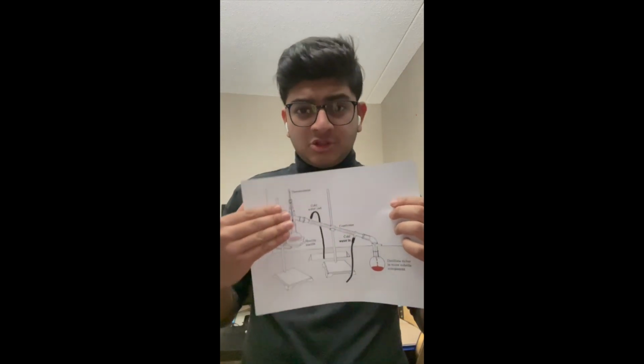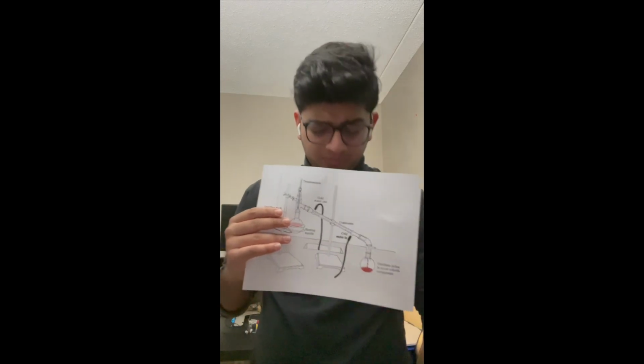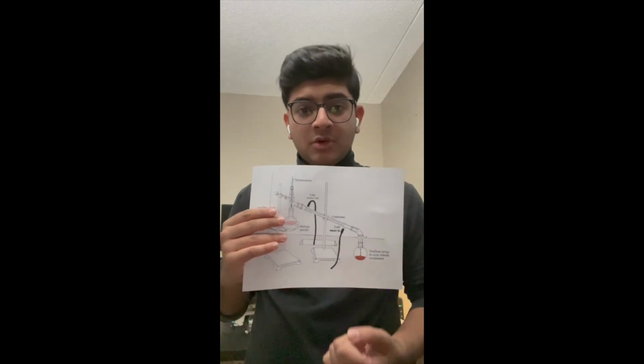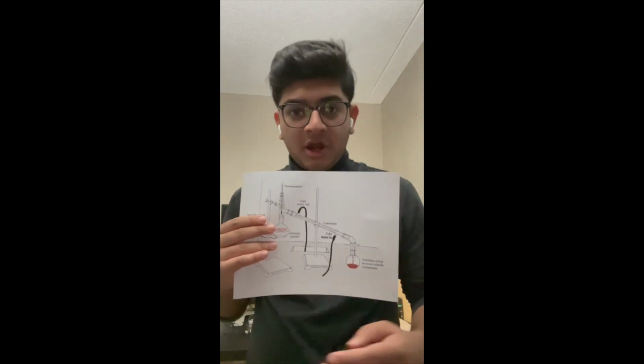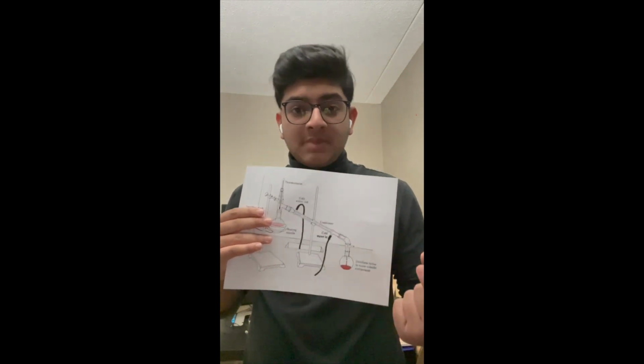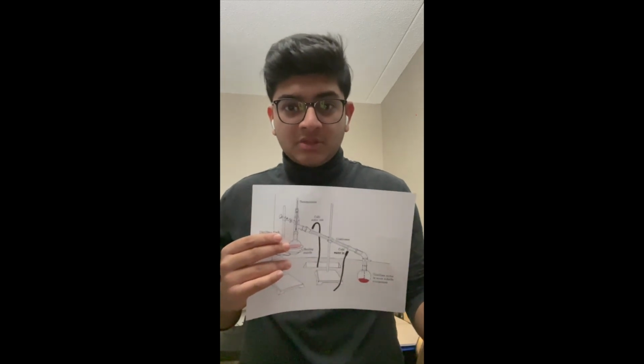Again, when the temperature reaches a stationary point that is not varying by more than 1 or 2 degrees Celsius, we start collecting our liquid into a separate vessel to obtain our substance B that might have a higher boiling point. So in this manner, we obtained two substances in their purest form using their different boiling points.